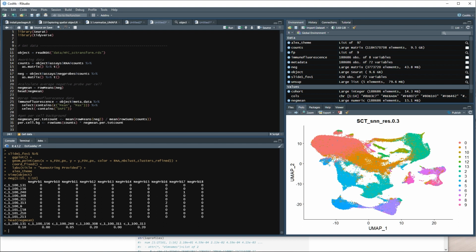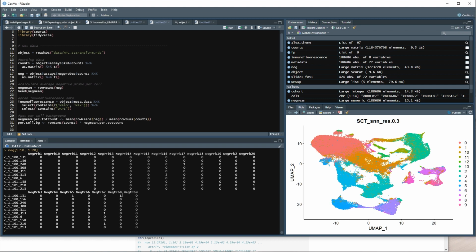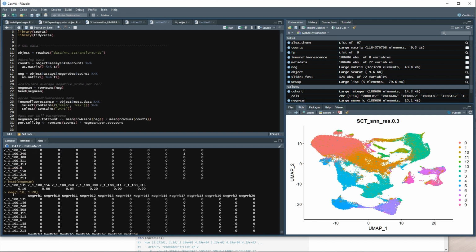So if we look at the first cell, actually, let's go back up. Let's look at 1 through 20. So these are all of them. We have 1, and then there should be another one, 2. Yep, so 2 out of 20, so that gives us 0.1 as our average, right? All right, so now we have our negatives, our average negative.